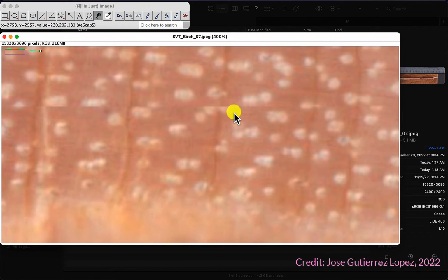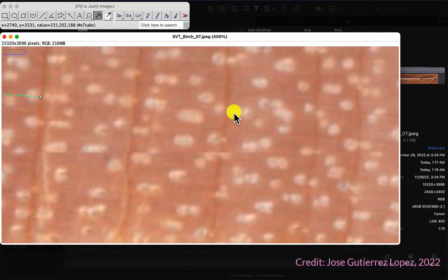This line here that you see, I think it's an issue with the scanner, but it's not affecting, or maybe I moved the sample accidentally a tiny bit. So I need to double check that again. I mean, I might have moved it when it was being scanned.